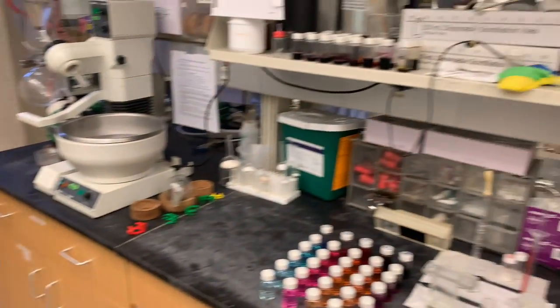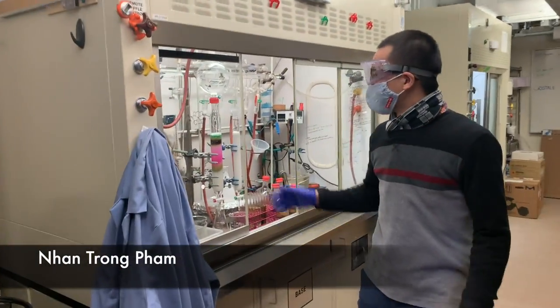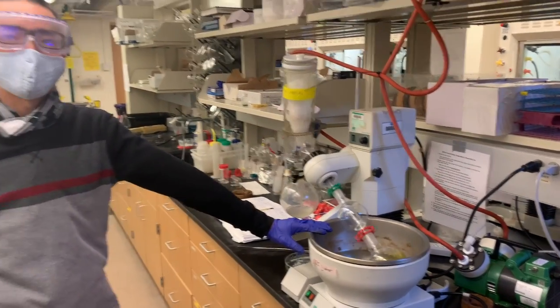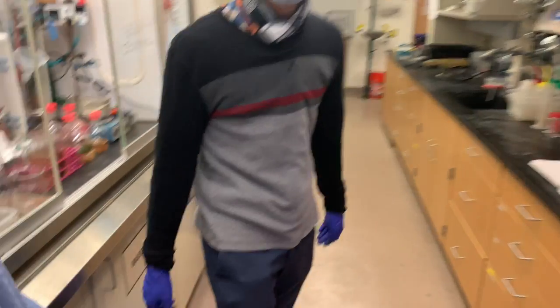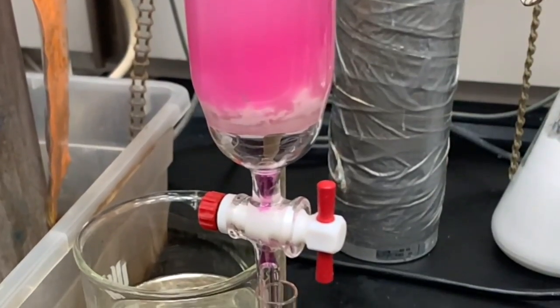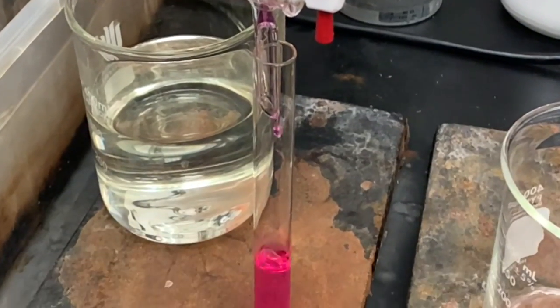Hey Jan, whatcha doing over there? Hey Max, I'm purifying one of my compounds using the column and then I will collect the fractions using the rotavap.